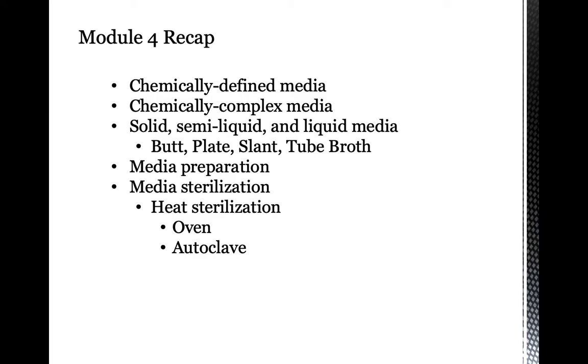So you just do proper ratio and proportion in order to identify what amounts you need, the total lyophilized medium you need, or if it's broken down into several ingredients, you can identify what specific weight is needed. If, let's say, you're asked to prepare 500 milliliters of your culture medium, then the standard formula that we have in practice is always prepared for 1 liter.